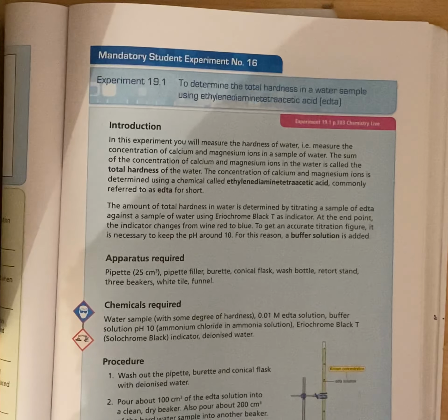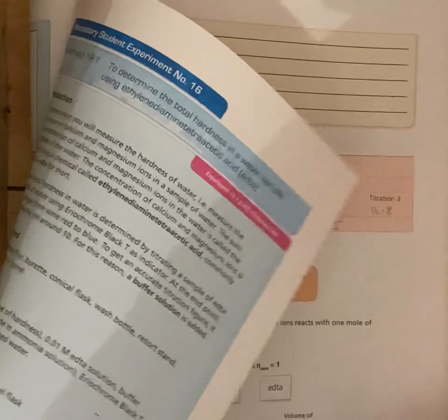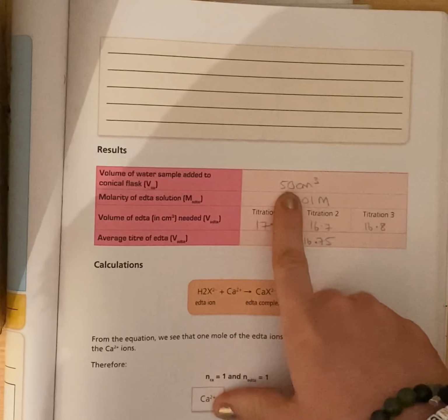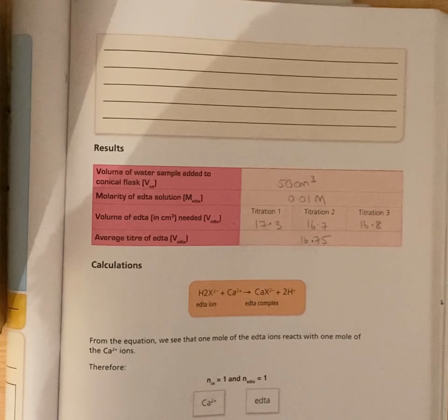Okay, so we're going to look at experiment 19 to determine the total hardness of a water sample using EDTA. So you're going to use a 0.01 molar EDTA solution, and you're going to have 50 centimeters cubed of the water sample in your conical flask rather than 25 centimeters cubed this time.